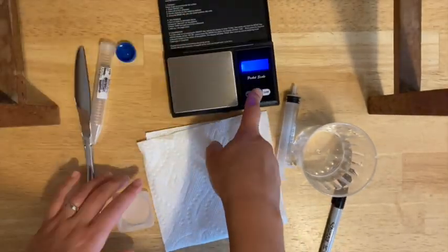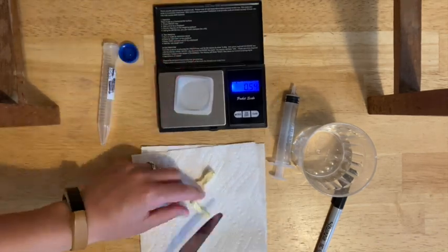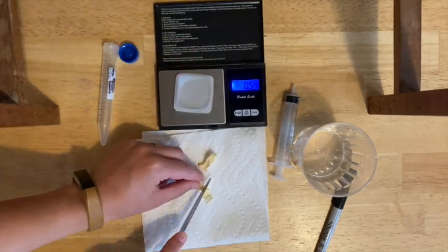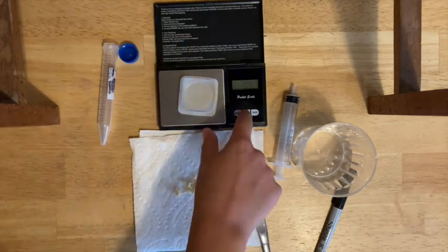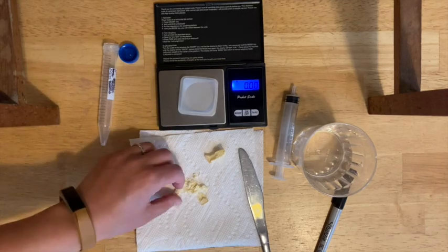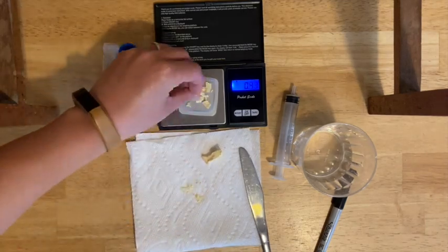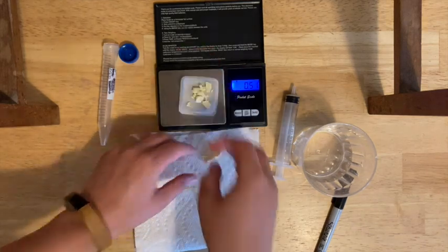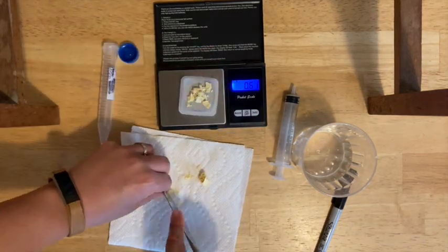Your next task is to weigh out one gram of the freeze-dried pineapple. I'd suggest cutting up your freeze-dried pineapple into little pieces to make it easier to get the exact weight. Make sure you use your weigh boat and zero the weigh boat before you get going, and then weigh out one gram of pieces of dehydrated pineapple.